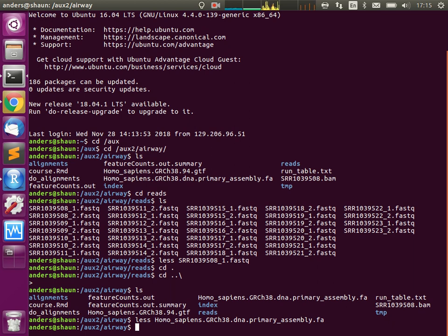The next important thing is precision. Does this thing properly deal with slight mutations, short indels, like changes, 2 bases deleted, 3 going in? We don't care about this in RNA-seq. We do care about this in cancer resequencing. But we are here and not over there at DKFZ. So all these things about how to find DNA mutations, this is basically the two big ideas: either you want to find DNA mutations, or you care about RNA-seq, which is what we need to do here.